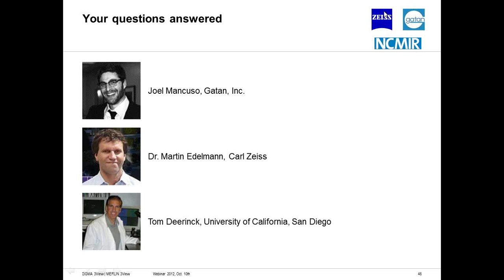Okay. Then if you have questions about the slice thickness, I think it's still for you, Joel. What is the reproducibility of the slice thickness? How do you measure slice thickness? We measure each system as they leave the factory, and we have an eddy current jig that measures the steps of how we move the sample up in Z.